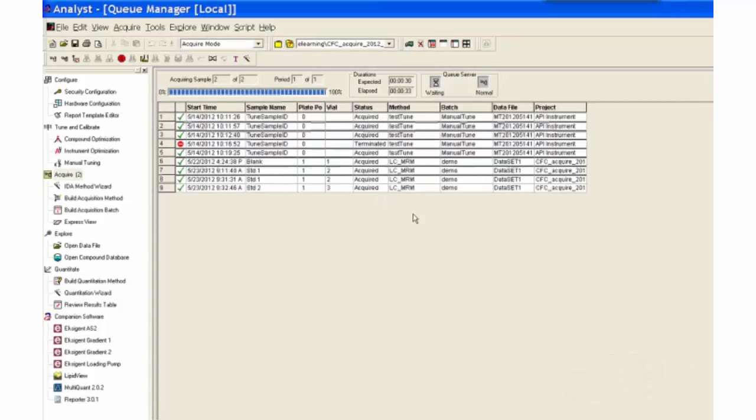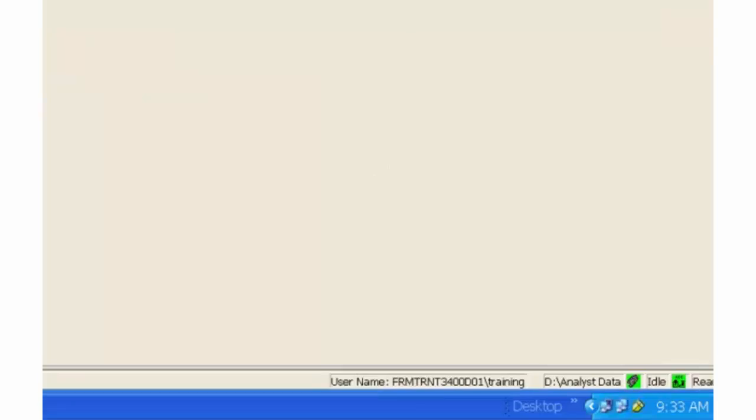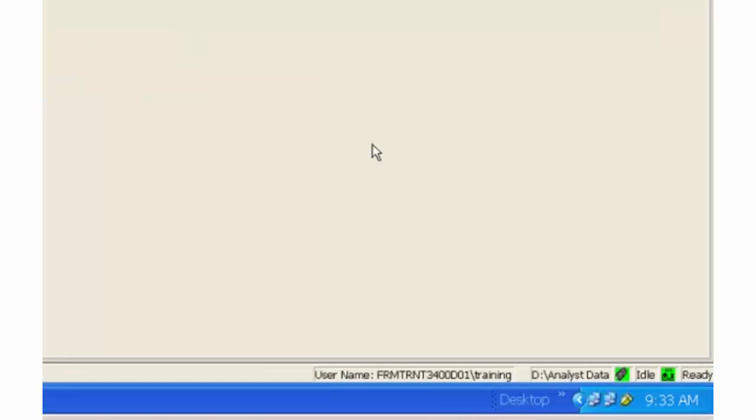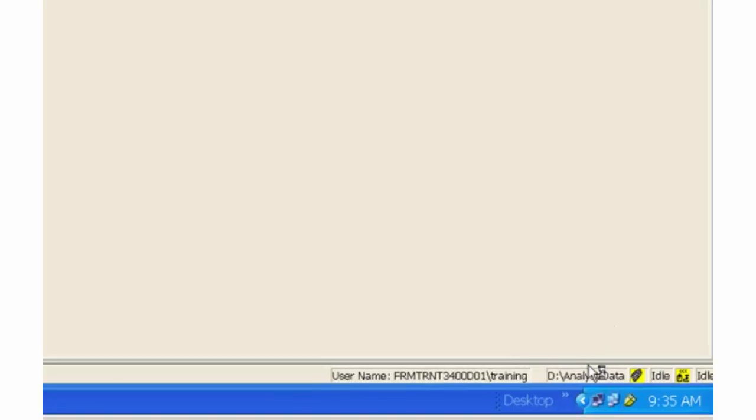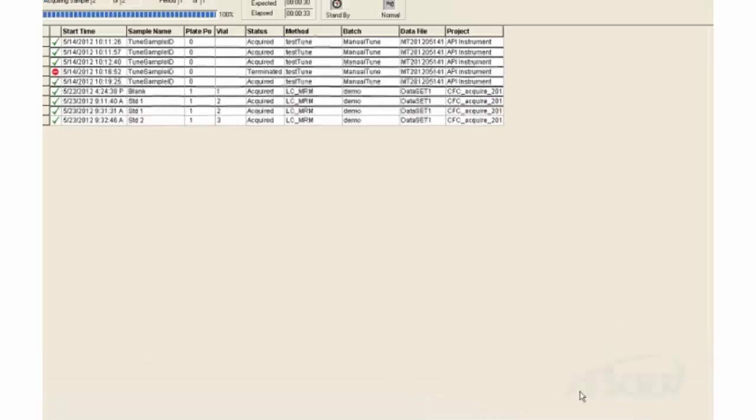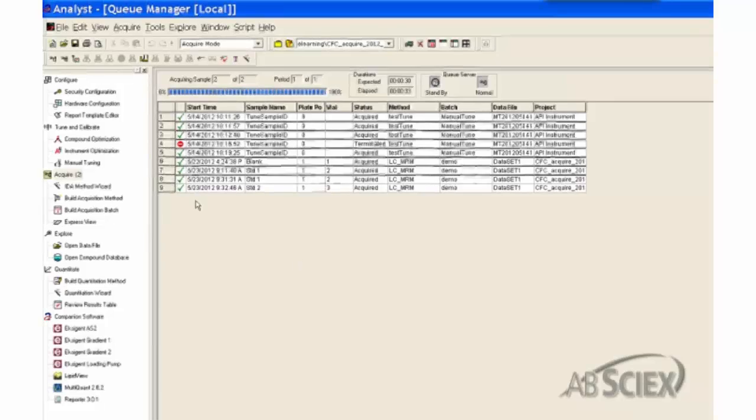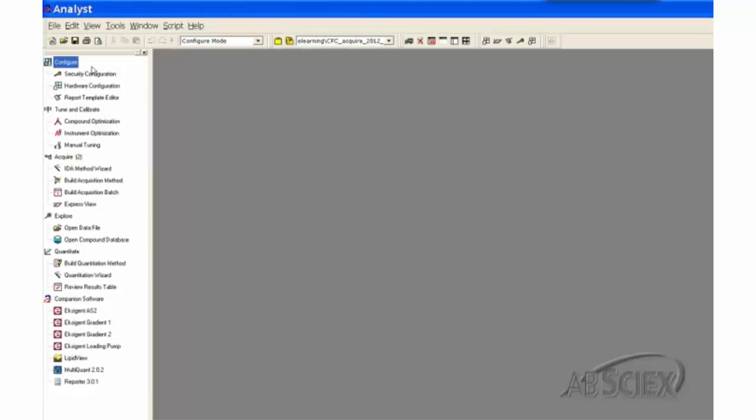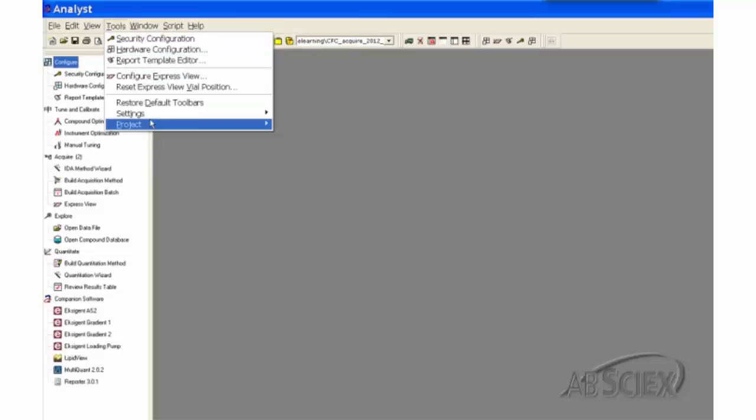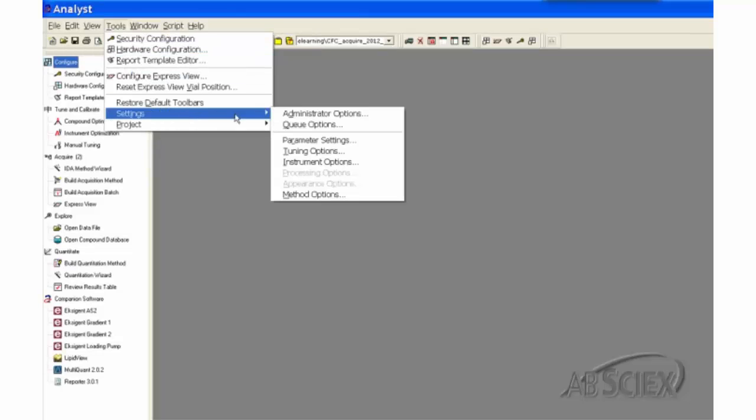After the instrument finishes analyzing all the samples in the queue, the system will stay in the Ready status first. Then, it will turn to the Standby status after a preset waiting period. This period is determined by the Max Idle Time setting, which can be adjusted in the Queue option window under Settings in the Config mode in Analyst.